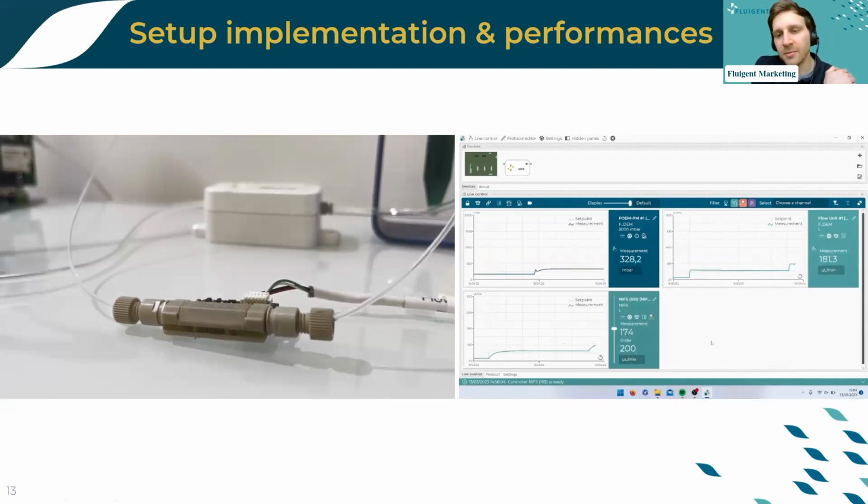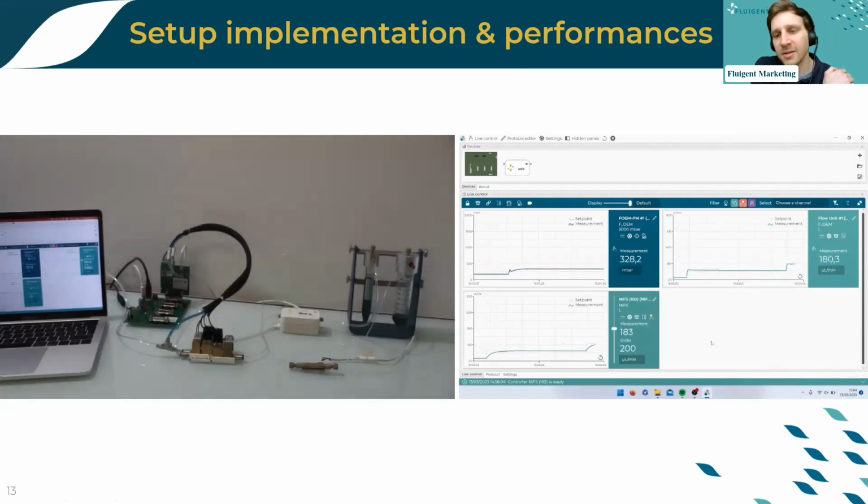What's also interesting here is that there's sometimes a slight difference between the two systems, for two reasons. The first one is that the NIFS will make a few increments in order to reach the perfectly right flow rate, so there will be some adjustments throughout time.